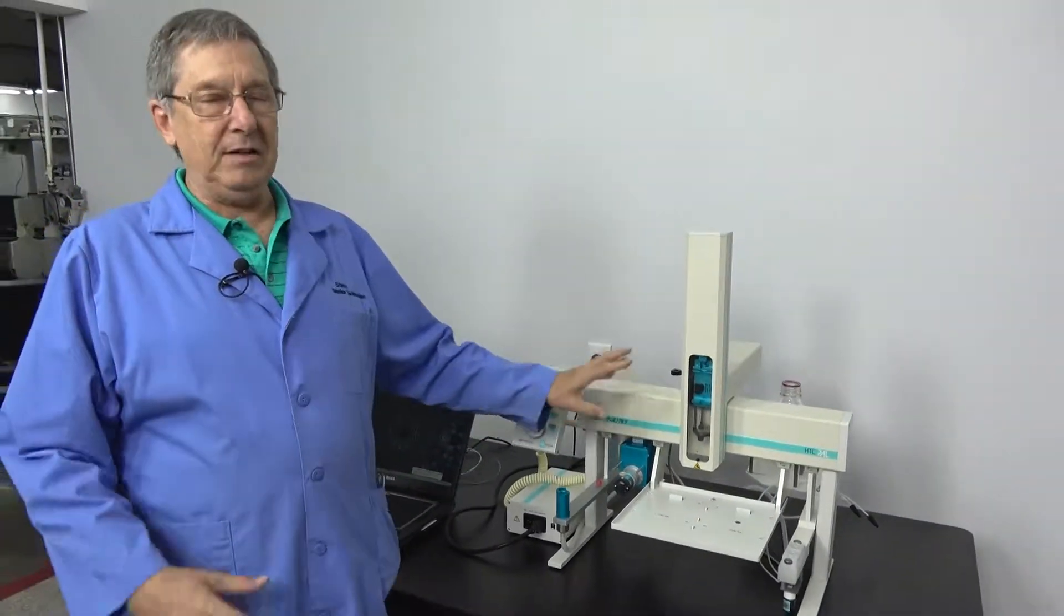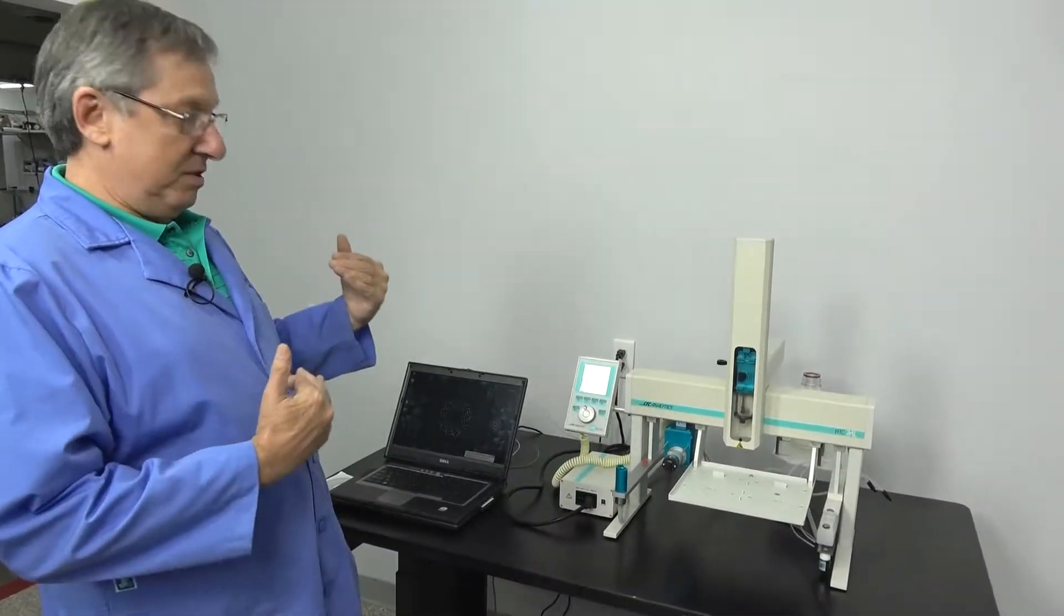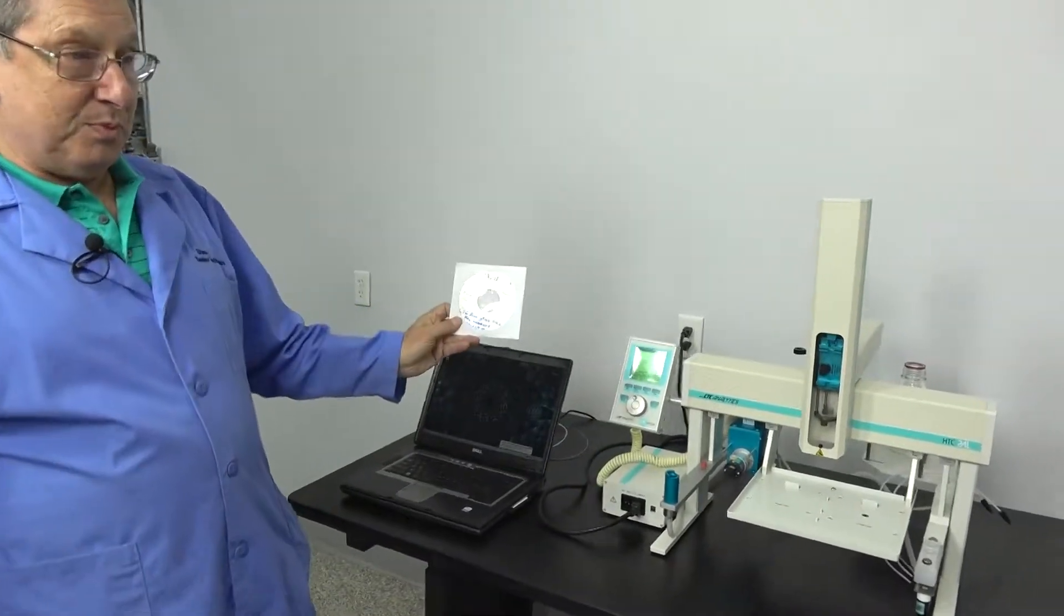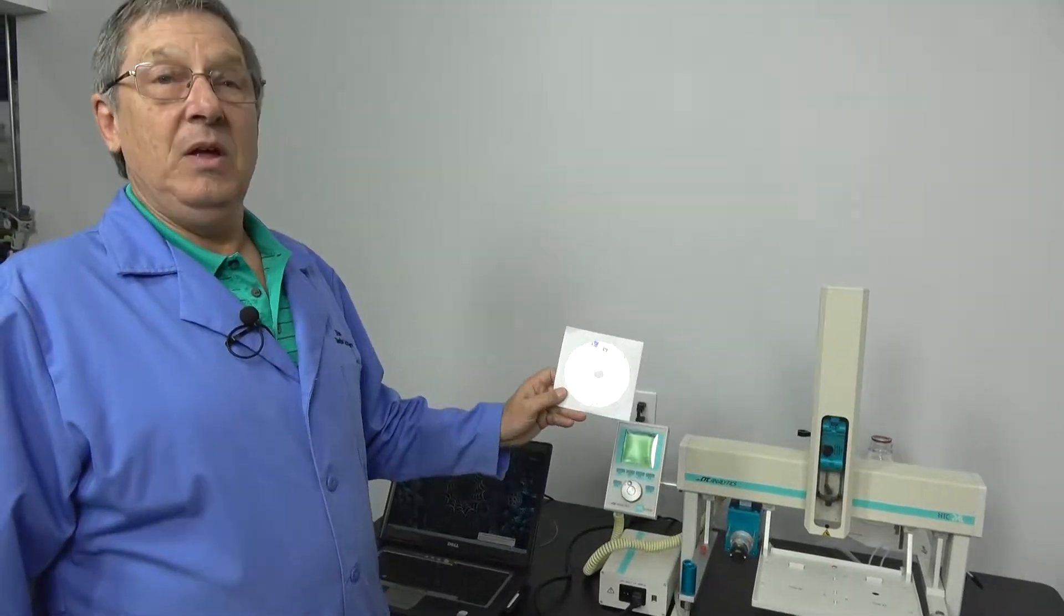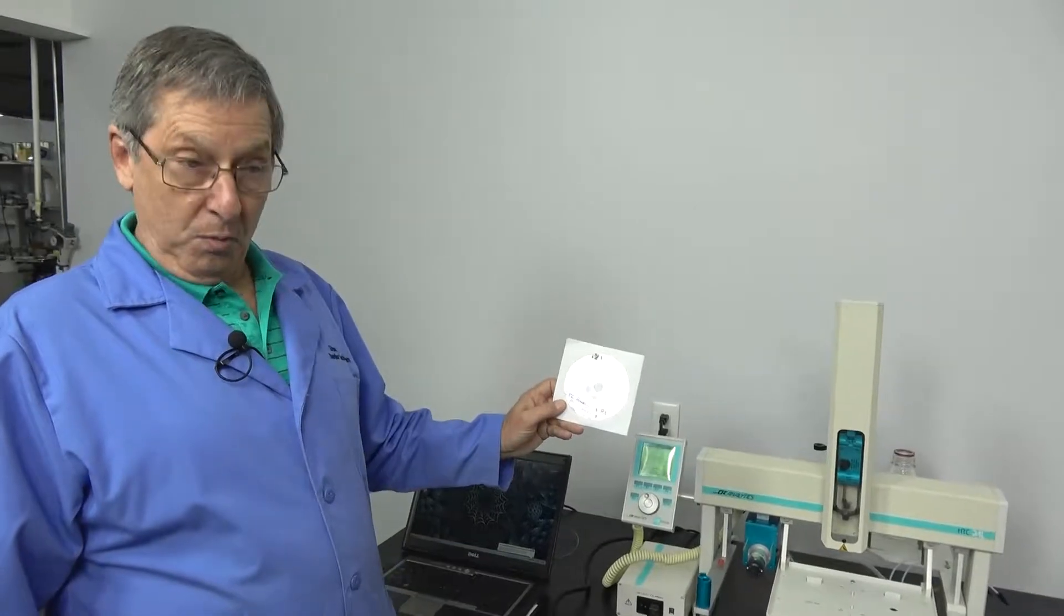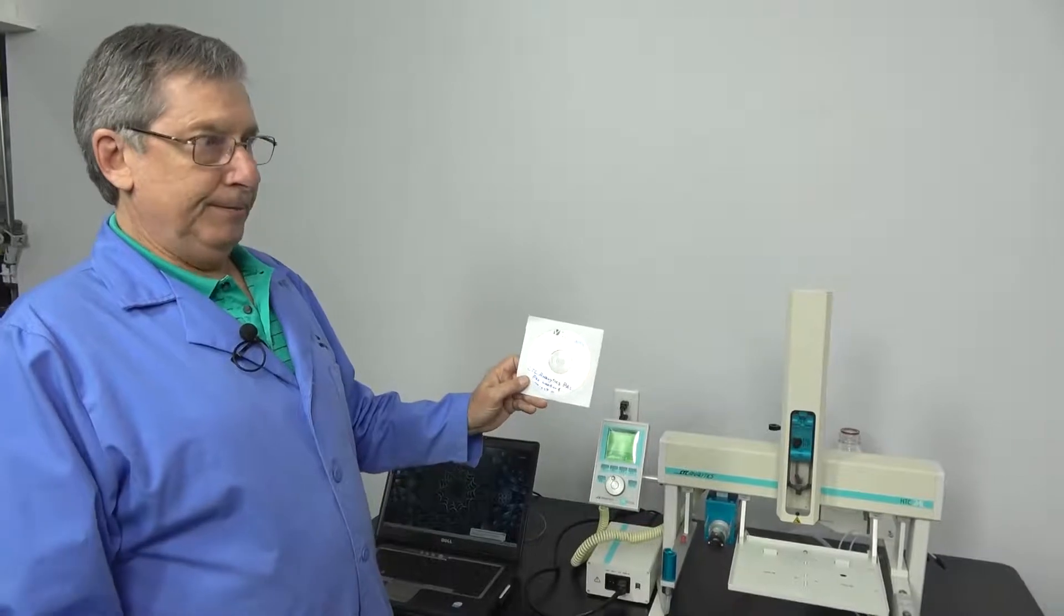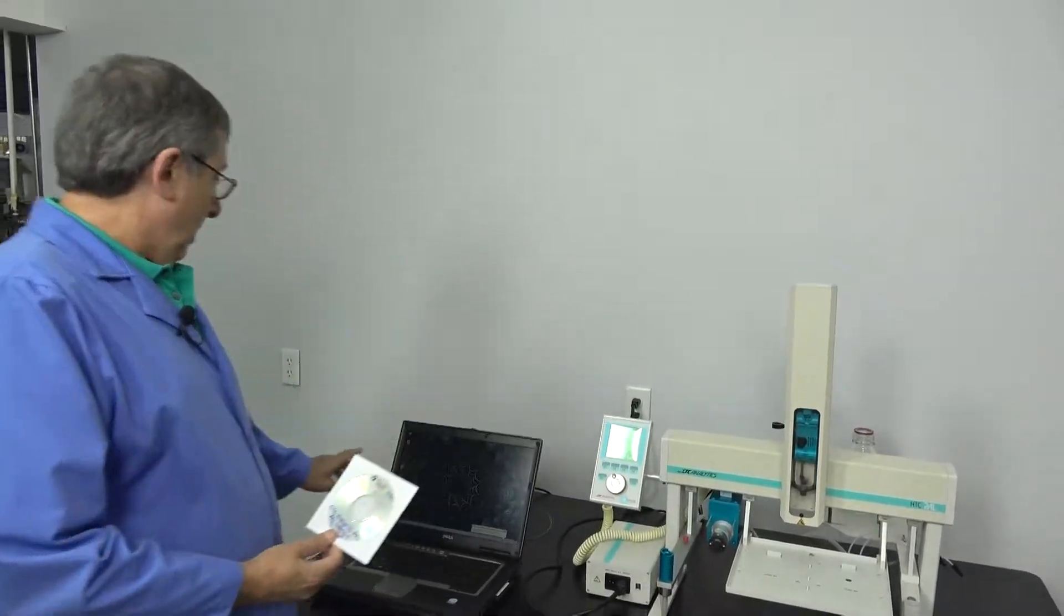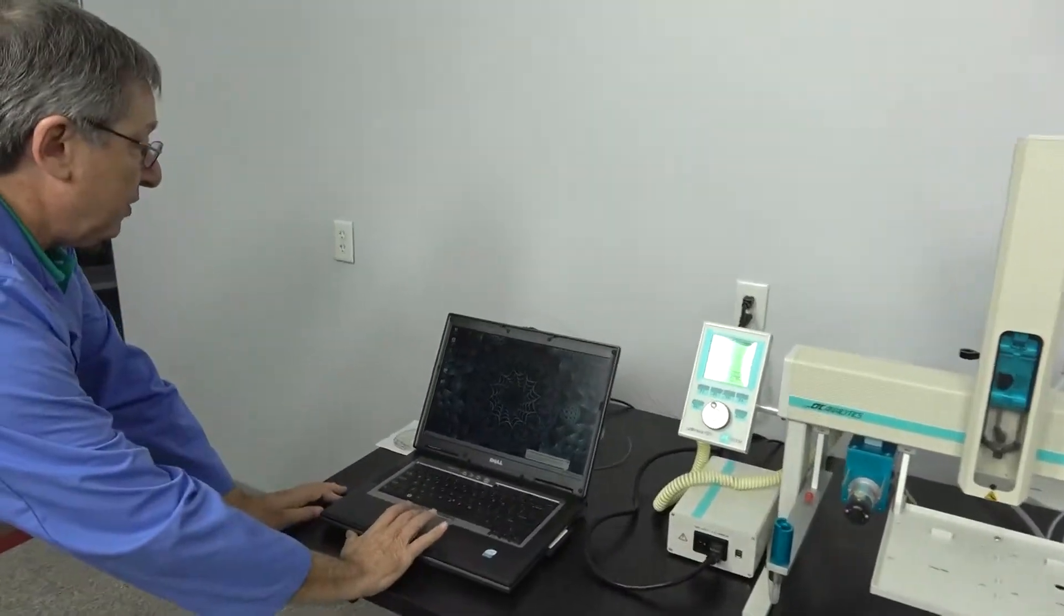There are cooler stacks available. There's a long list of items. We need to teach the system how to do that. On all the CTC systems we sell, we do include a CD, which allows you to upgrade your firmware or downgrade it, back up your software, restore it, and teach it about those objects. It is two pieces of software to do that.